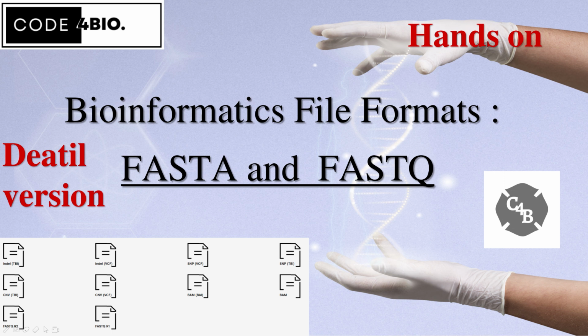In this playlist, we'll be delving into conversations surrounding the FASTA and FASTQ file formats.